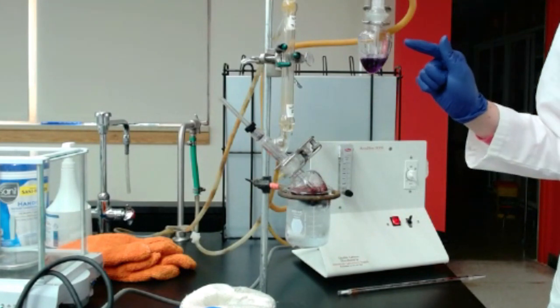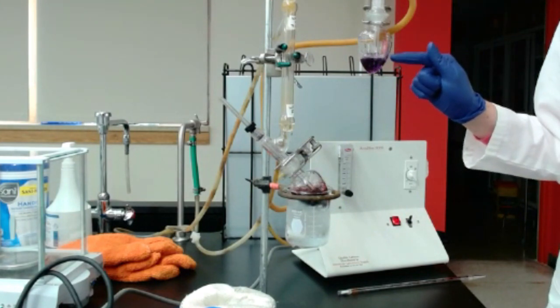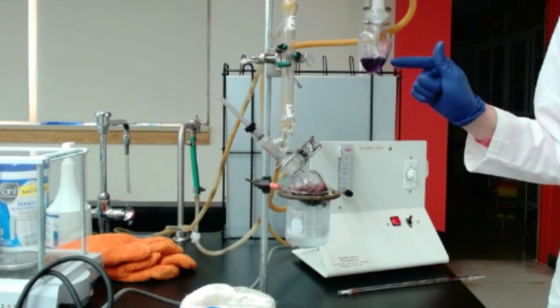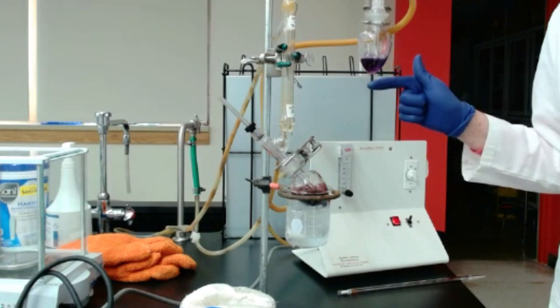So you can already see that the color changed from pale green, which is a little bit surprising, to purple already.